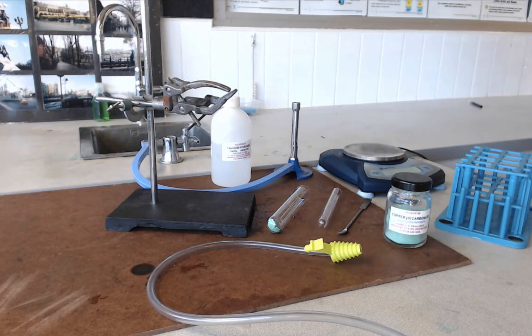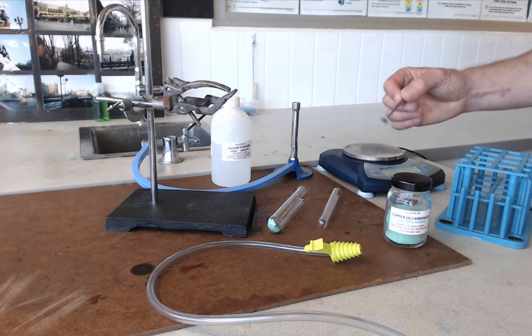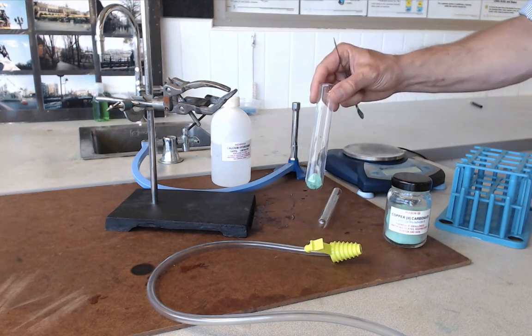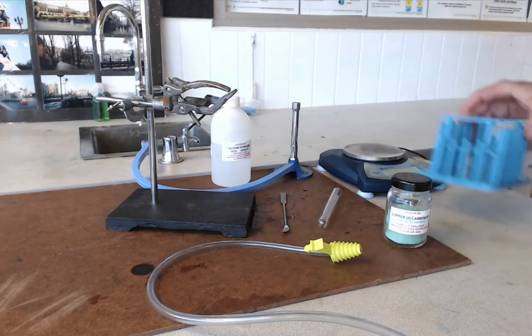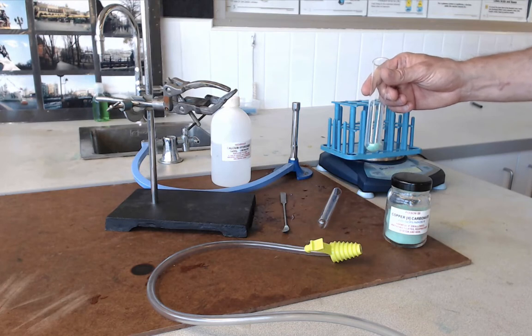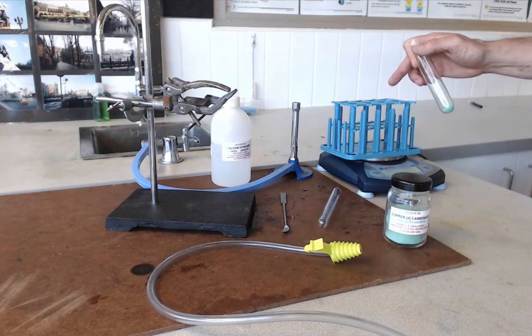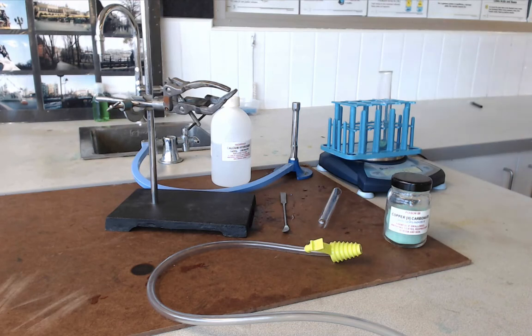The first thing you are going to need to do is get about two spatulas full of copper carbonate into your boiling tube. I have already done that just to save a little bit of time. Next, weigh this boiling tube with the copper carbonate in it — put the test tube rack on the balance, hit zero, and record how much your boiling tube weighs.